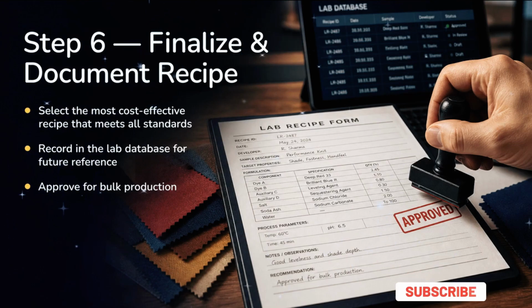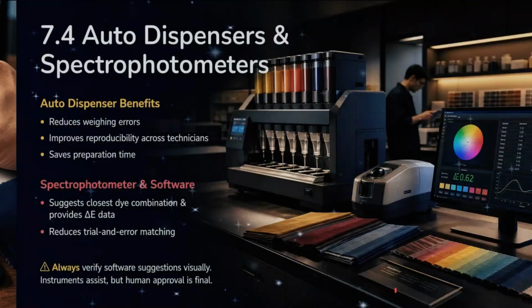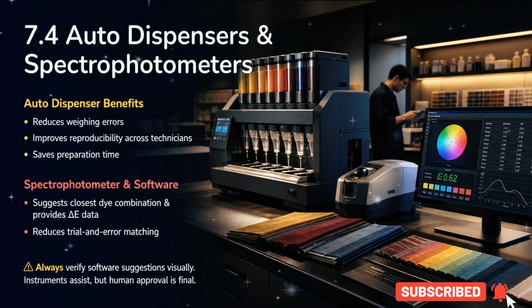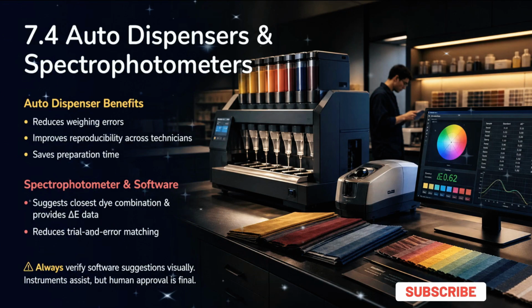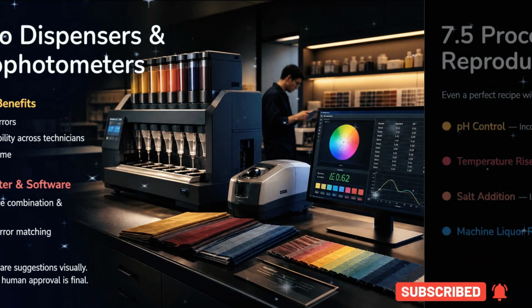Select the most cost-effective recipe that meets all standards. Record it in the lab database for future reference and approve it for bulk production. Autodispensers and spectrophotometers are valuable tools. Autodispensers reduce weighing errors and improve reproducibility. Spectrophotometers and their software suggest dye combinations and reduce trial and error. Remember to always verify software suggestions visually.